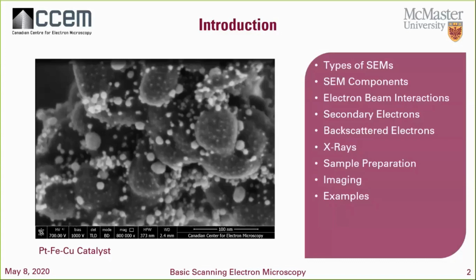I'm going to go briefly into sample preparation, but in no way is it really going to be covering the subject matter. It's more of an introduction to it. And then we're going to be talking about doing imaging in the SEM and some examples of some of the things you can do in the SEM. But in no way does it cover the wide range of things that you can actually do. You can see a nice picture here from one of our SEMs showing a catalyst at fairly high magnification.